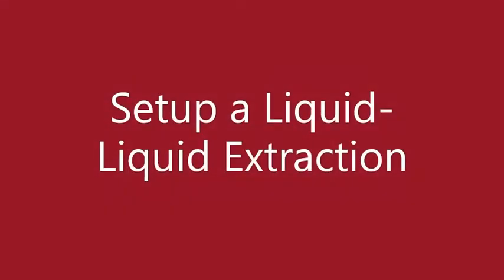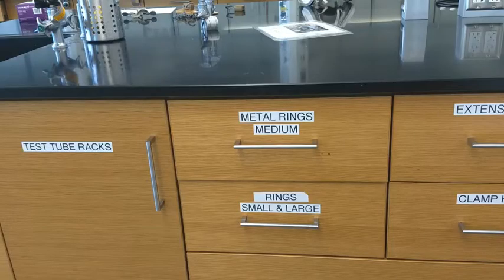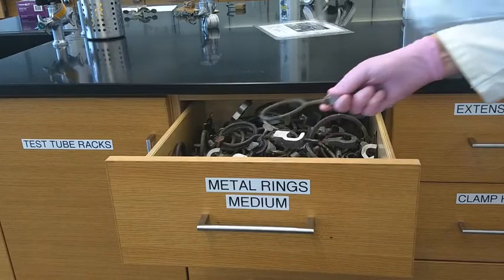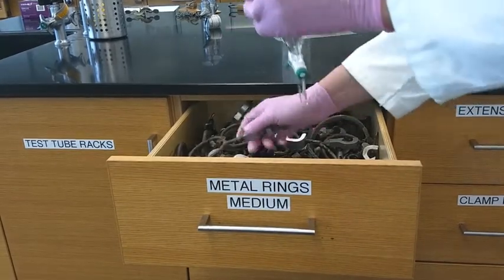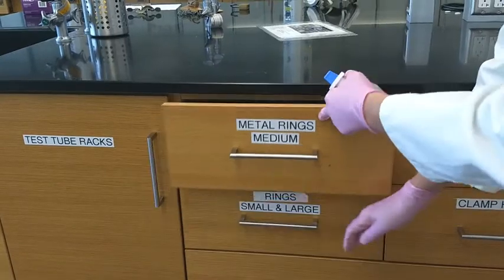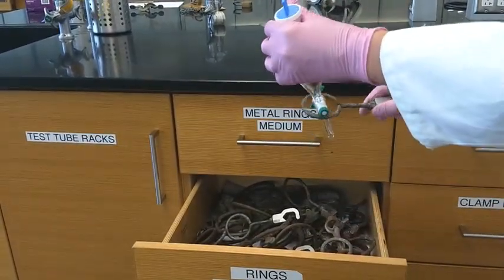In this video I'm going to talk about setting up a liquid-liquid extraction. You're going to grab a sep funnel and a cap, then go to the drawer right next to it and find a ring. Finding the right size can be a little tricky — it needs to go over the valve and yet hold the sep funnel, so you just need to try the two different drawers.